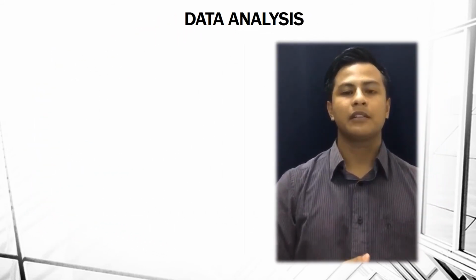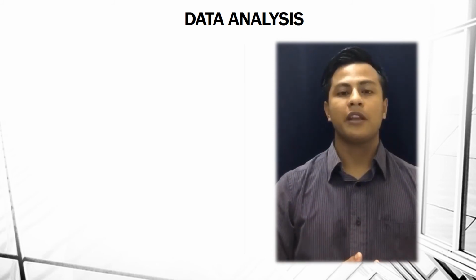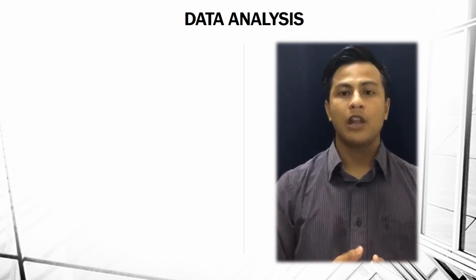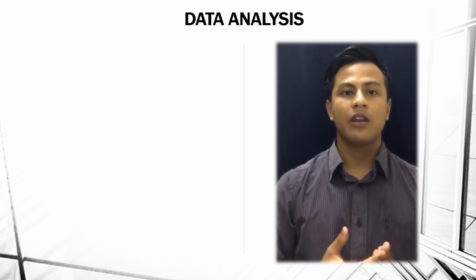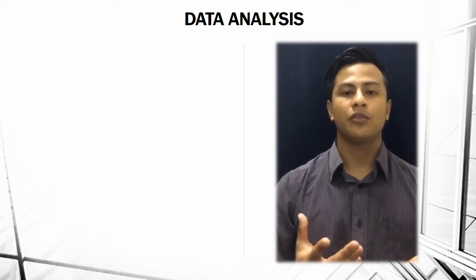The third part is data analysis. The data is analyzed based on the experiment that has been done on waxy crude oil by using HTGC. First, look at figure 1. It shows the HTGC trace of a waxy crude oil. The trace is visualized here in a graph, from which the difference of peaks is shown.